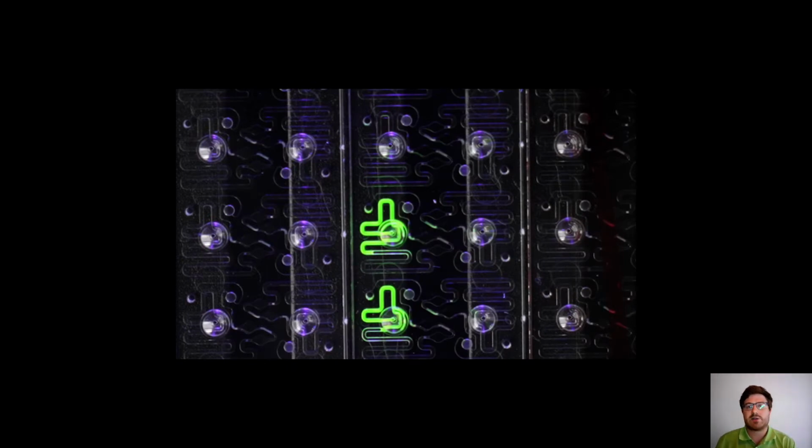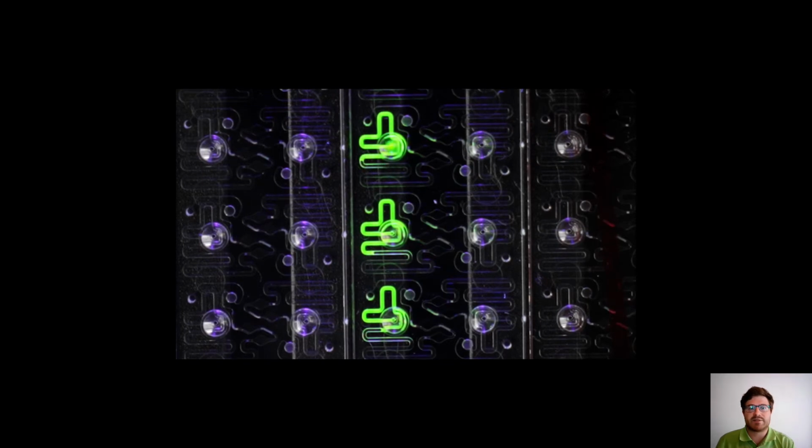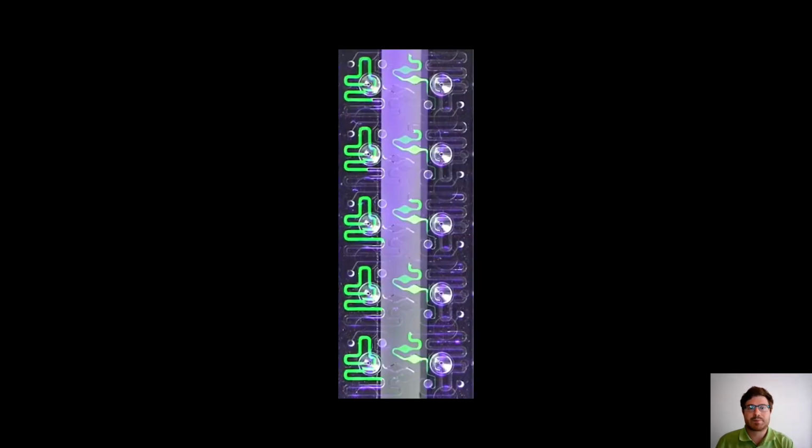Here we can see exactly what sample loading looks like with the help of some fluorescein and a blacklight. In 2 wells, we've already added 2 microliters of fluorescein. As you can see, to load another sample, you simply add 2 microliters into that input well, and the sample wicks into the plate. On the left, you can see loaded samples, and on the right, the samples have already been measured, and you can see both microcuvettes in the Stunner plate now contain the fluorescein.